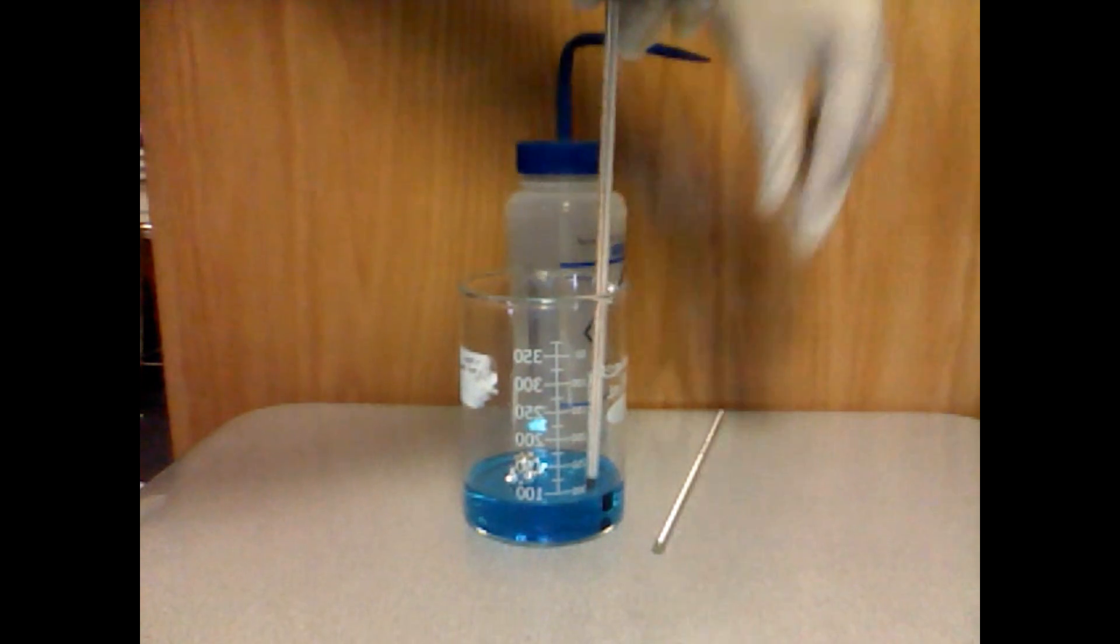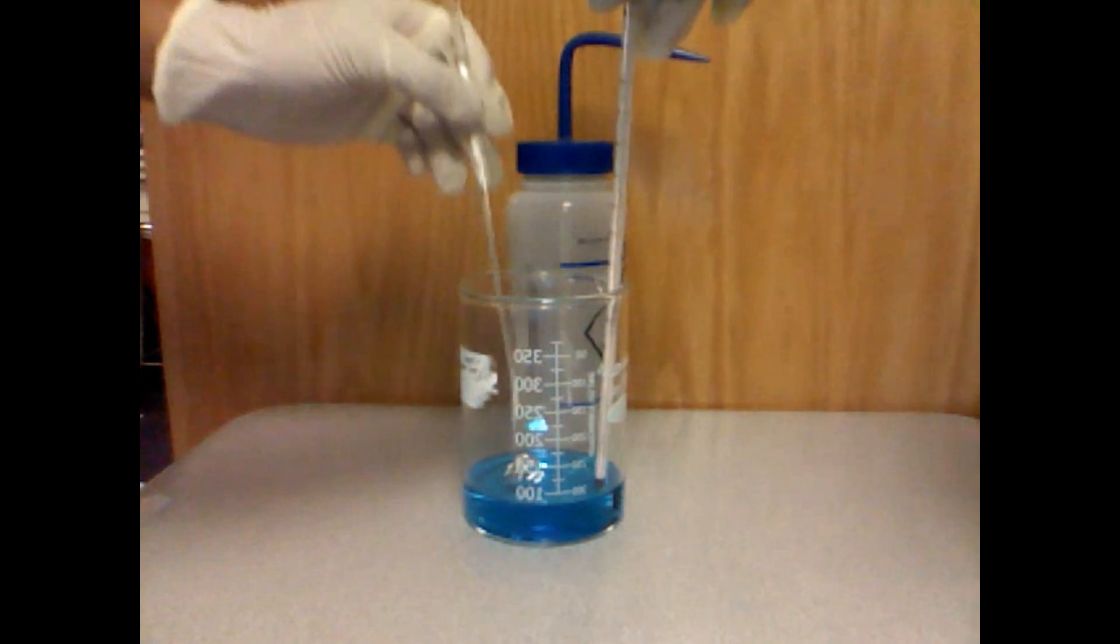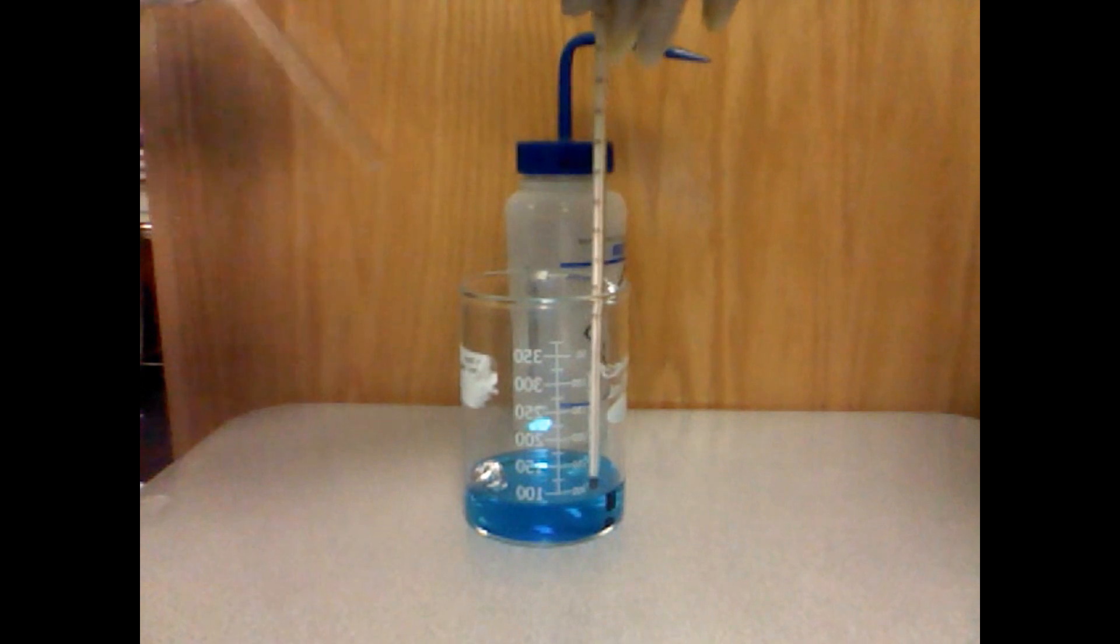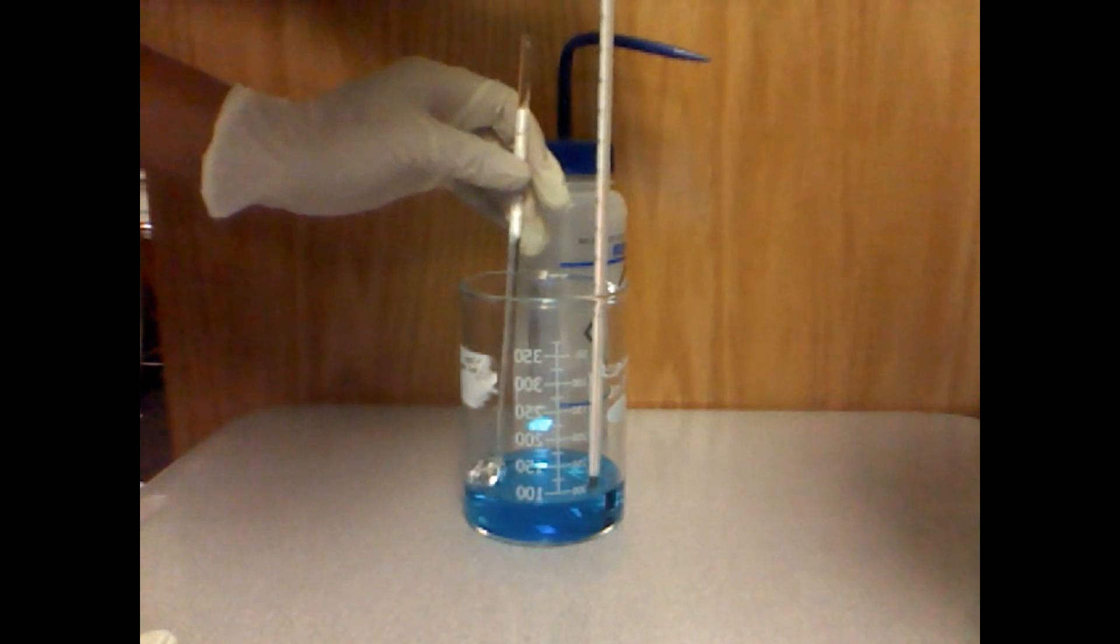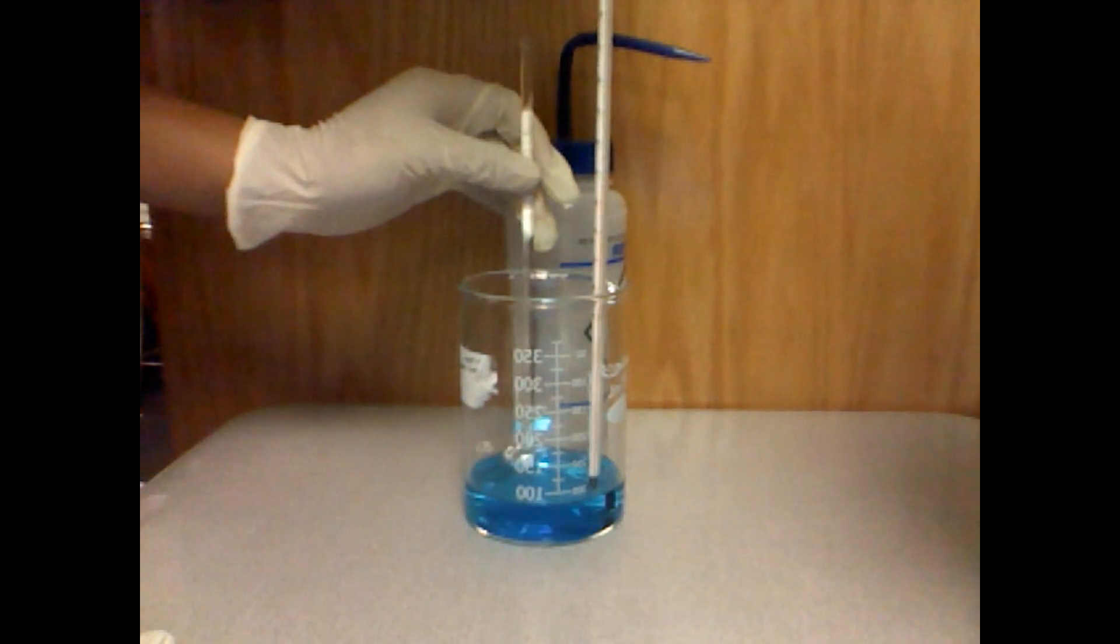Place the aluminum foil into the beaker and stir it around using the stirring rod. Watch the change in temperature and what happens to the aluminum foil inside of the solution.